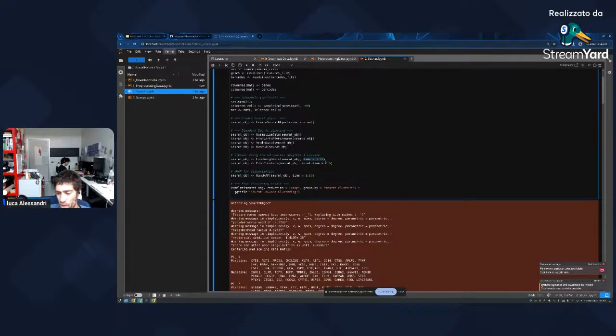So whenever we project something from a high dimensional space to a lower dimensional space, that means that we are dividing this object into dimensions. So if you think about the donut before, the donut is the composition of 3 different axes: X, Y, and Z. So when Seurat is doing this RunPCA, it is like dividing, dissecting our data set through dimensions.